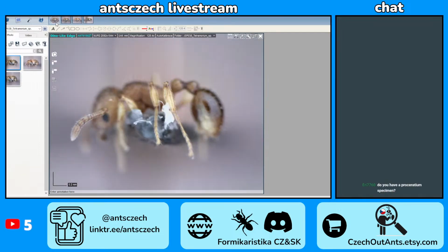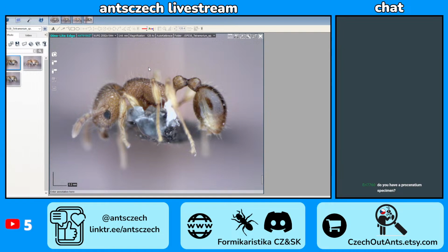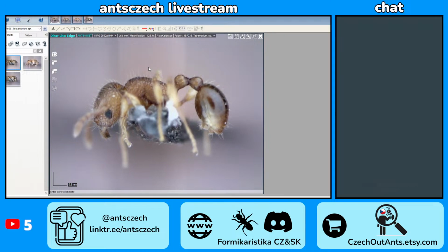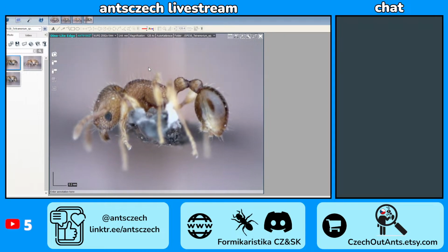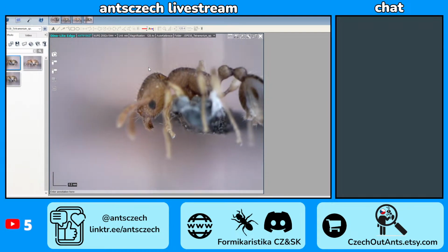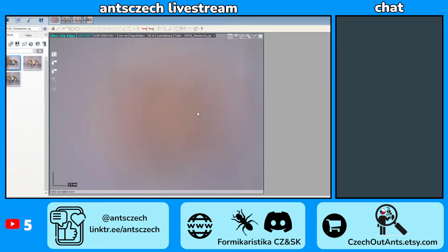Yeah, this should be fine. I think I have a Proceratium, but it's still in alcohol. From Germany? No, I collected it. Okay. Pretty cool. I think we found it in Sumatra. Could be also Java, but in that area. Oh yeah, you have one species. I don't think it's German native.